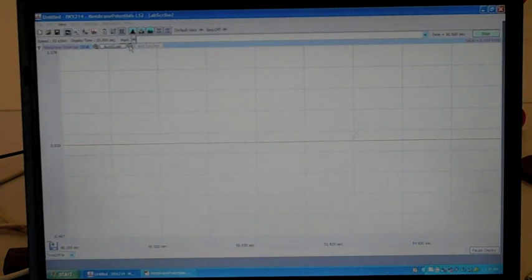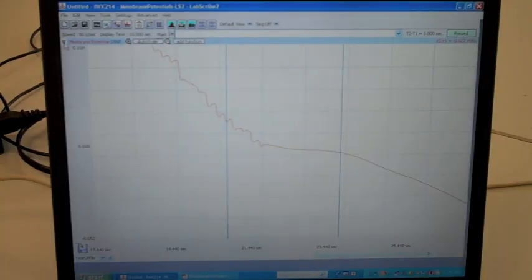So I've zoomed back, and you can see that recording line is centered around the middle. It doesn't have to be in the middle. Again, you can always change the scale later if it doesn't look appropriate to you. To bring this back into scale, we're going to use this icon on the far left next to where it says membrane potential. There's a little triangle that I'm going to click, and I'm going to go to scale at the bottom of the menu. Not auto scale, I want to set the scale.